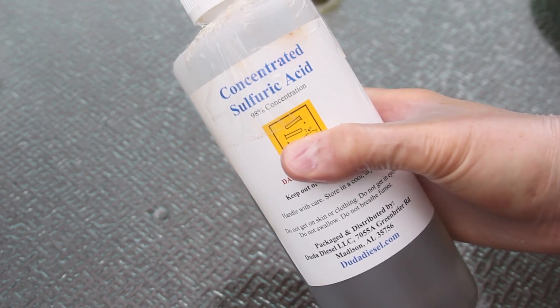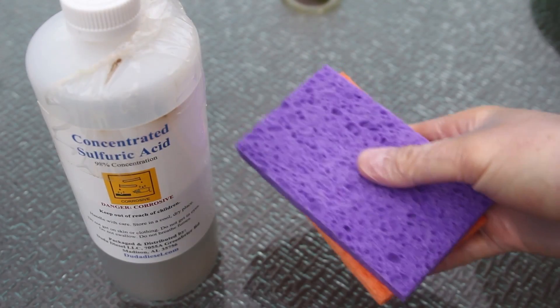What's up, everybody? Welcome back to my laboratory, where safety is number one priority. For this experiment I'm going to use sulfuric acid and a couple of sponges. Let's check this out.